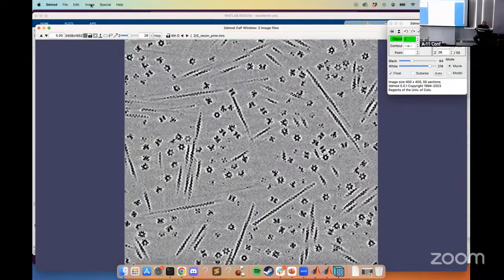There is no cylinder correlation kind of central line extraction on the filaments like Amira has. I keep pounding them about it. And one of the things, I don't know, has anyone ever used that cylinder correlation in Amira? I did a lot when I was in my postdoc.